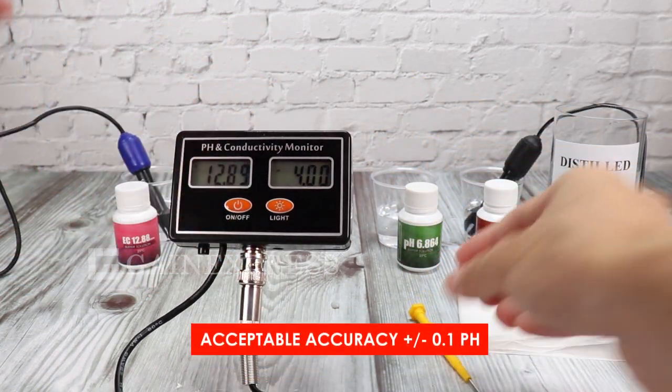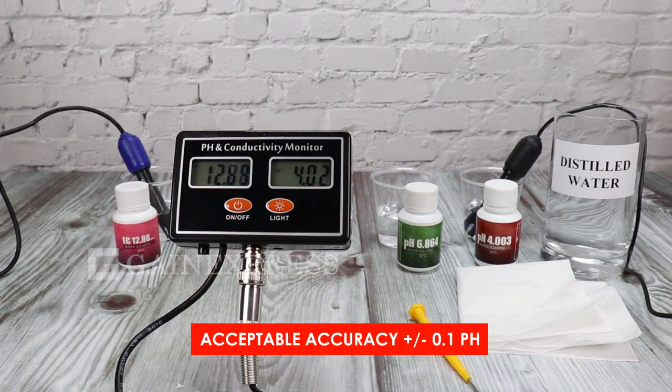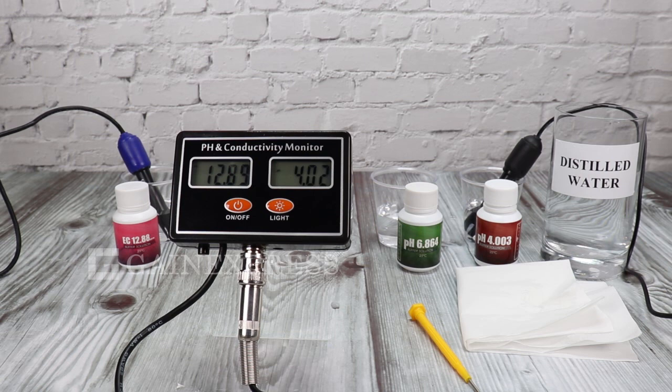Again, if the display value is within the error range, it is acceptable. And the calibration for ECM231 is done.